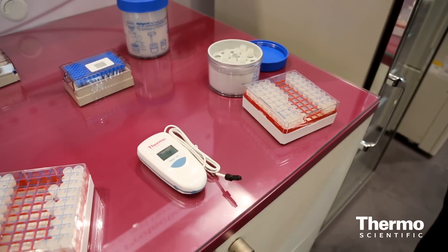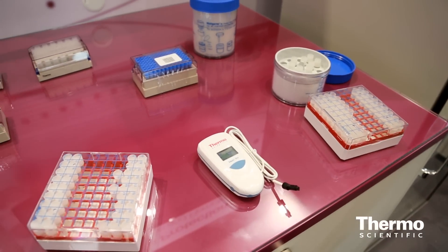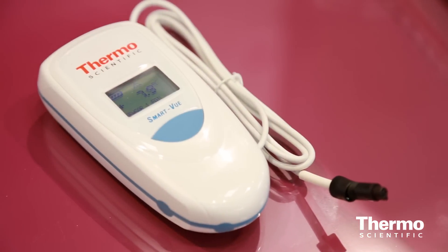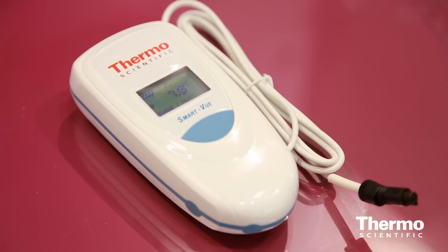You have a transmitter and a probe which goes into the chamber. It's not attached to the instrument in any way whatsoever. It has an internal battery which lasts for five years, and it's collecting data every five minutes, or whatever timeline the scientist wishes to set. The data gets collected onto a server, displayed on a graph, and you can access this remotely via the world wide web.